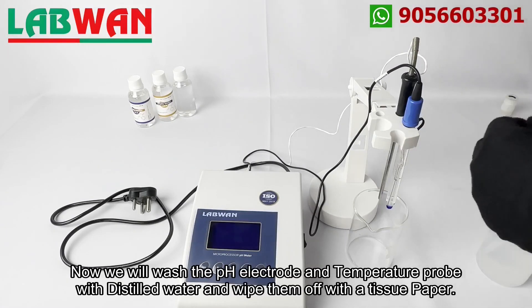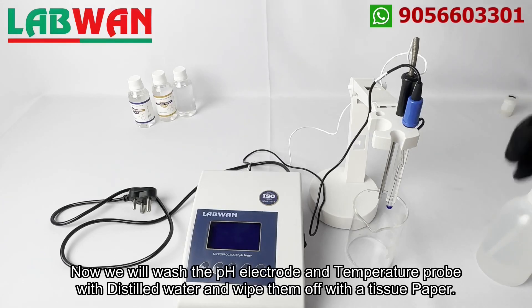Now we will wash the pH electrode and temperature probe with distilled water and wipe them off with a tissue paper.